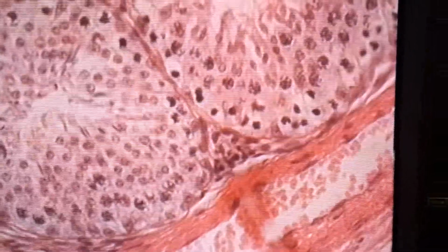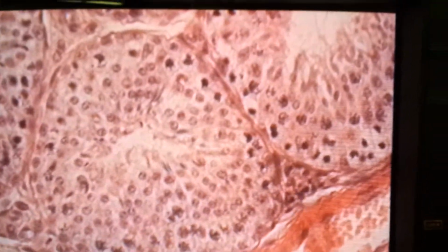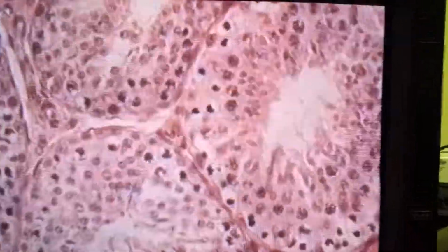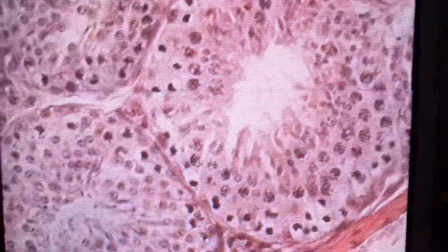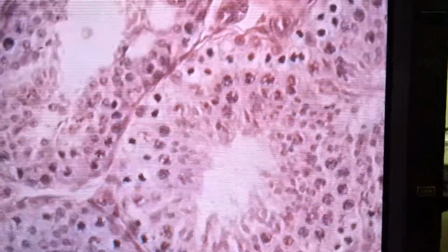Can you show us secondary? Secondaries, in context of primary, of course. Well, that's where it's hard to do. No, those are spermatids, right? These look more like spermatids. They're a lot smaller. Let me just tell you, I won't ask you about secondary spermatocytes. Those are hard to find. Well, they're easy to find. I mean, they're hard to differentiate.